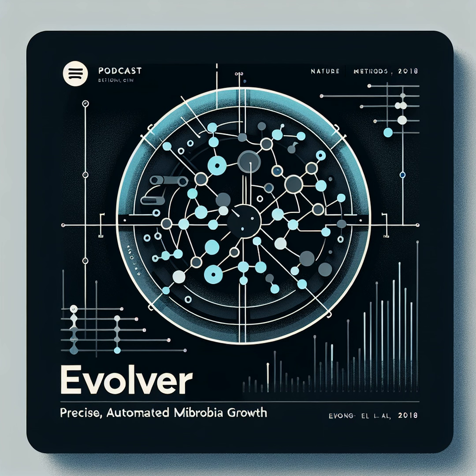That's where things get really interesting. It's inspired by large-scale integration in electronics. They use miniature channels and valves to control the flow of liquids in a highly multiplexed way. This allows for much more complex fluidic operations, including things like dynamic media mixing, automated vial-to-vial transfers to prevent biofilm formation, and even automated yeast mating. That's incredible. So it's not just about controlling individual cultures, but also about controlling the interactions between cultures. This opens doors for whole new classes of experiments.